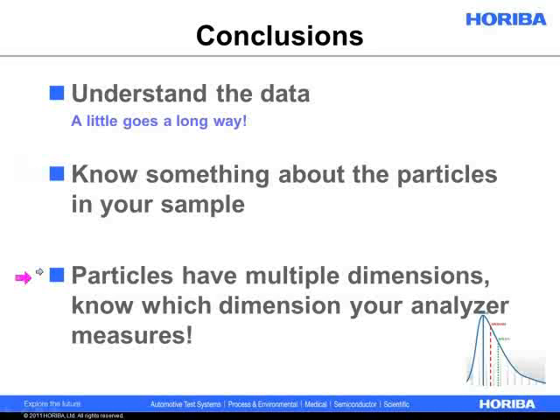And particles have multiple dimensions, and it may not necessarily be important to know every single dimension of your particles, but know which dimension your analyzer or analyzers measure. If you have something that looks like a needle and is large enough to be measured by image analysis, there may be an advantage for you to measure it with an image analyzer as opposed to a light scattering technique, which assumes that everything has to be a sphere.